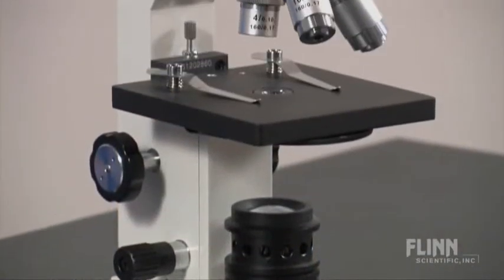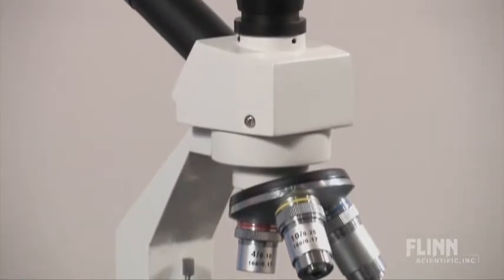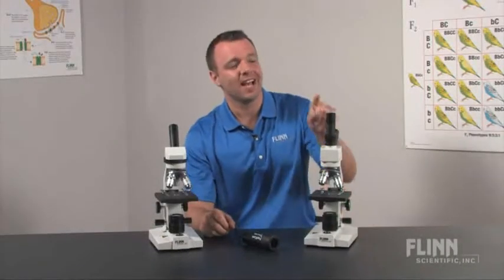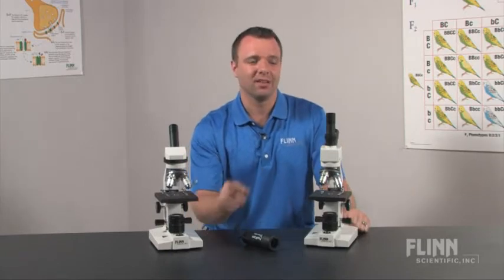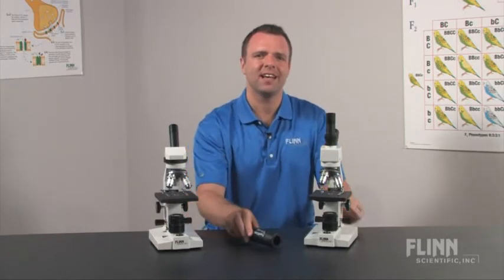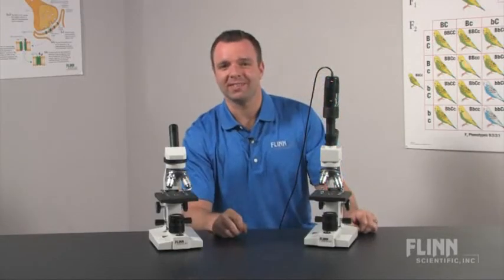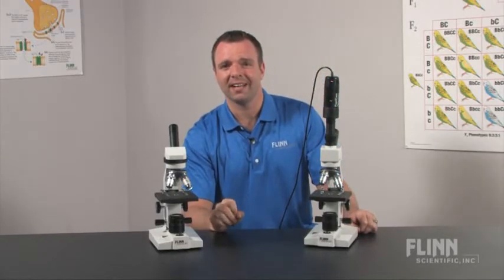The MS5005 model is perfect for connecting to your video microscope system. This model has a second ocular on the top, allowing you to locate a field of view as you normally would through the monocular, and then project it through the second ocular. This saves you valuable time, and your video system will stay safely secured to the second ocular.